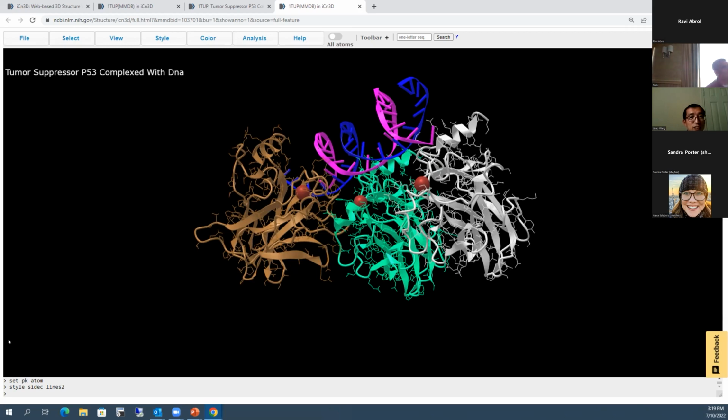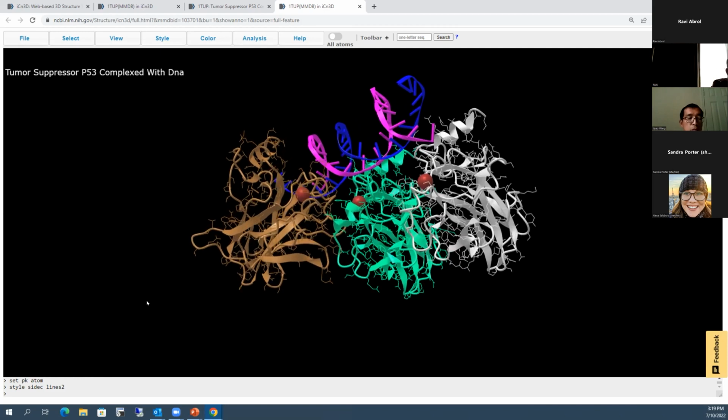Another thing that I want to point out is that at the bottom, this is tracing the steps that you're taking. It's writing it out. So that can be helpful. Sometimes if you accidentally select the wrong thing, you can see exactly what you did down here in that little bar, and that's helpful. So if we don't have any questions, I do want to just plow right through and get to coloring so that we can get to more advanced stuff.